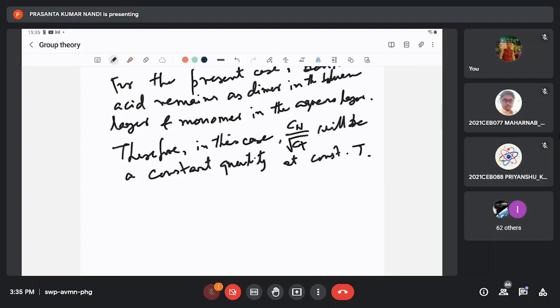Now if you need any clarification, I just discussed already that benzoic acid is such a molecular species which remains mostly in dimeric form in the toluene layer, that is, the non-aqueous medium. Whereas in aqueous medium, that is in water, it ionizes partly as benzoate and the corresponding hydronium ion. But this dissociation or ionization is very weak.